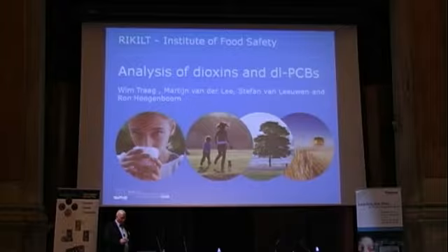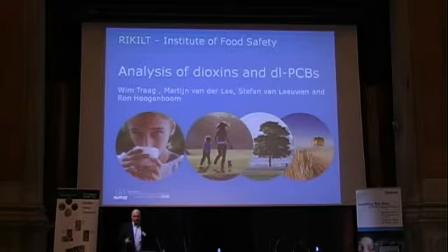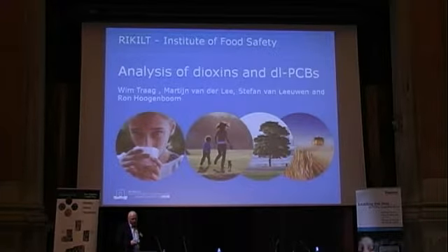So our method so far is first screening with the CALUX and then confirmation, not only for the suspected ones, but also for a small amount of the negative ones, with a high-resolution mass spectrometer.